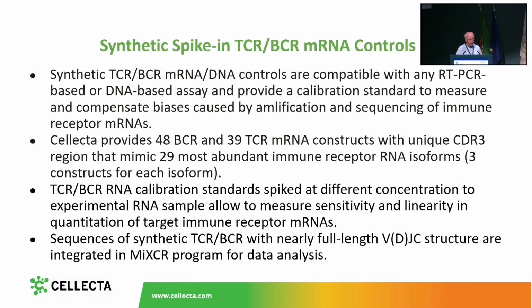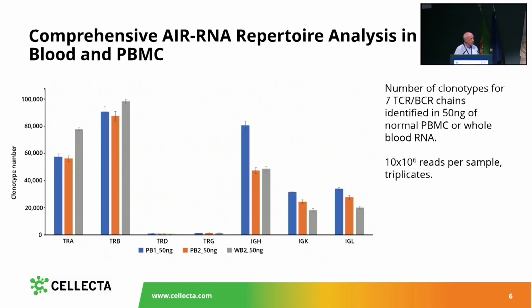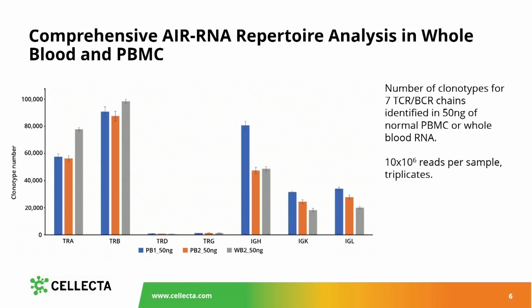And what's good is that all sequences which we designed are already incorporated in the MiXCR software package. So if you try to use it, it's very easy to use this type of standards to see how well the assay you developed works. If you try to use AIRR-C and take whole blood or PBMC, you can generate data similar to that shown here in this slide.